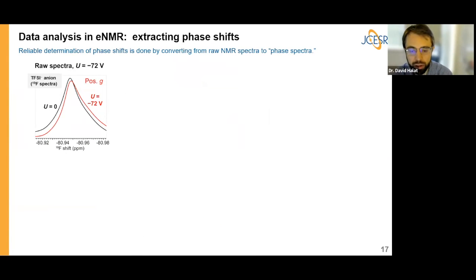All right, so once we've collected phase shifted spectra that we believe to be representative of ion migration distances that we trust, how do we go about analyzing them? And this is a non-trivial question, not just because there's no standard software or analysis technique that one can really apply directly for this problem. So I'll present the method that we've used, which to my knowledge is unique, while noting the literature is full of other methods as well.